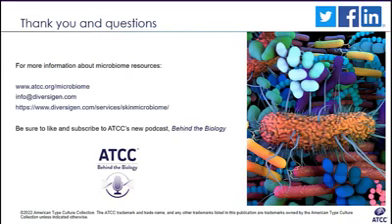I would say that the standards that we have right now do what they intend to do, just to make sure that your microbiome pipeline is reliable. And again, their applications may change depending on the goal of your study. We must make sure that all the steps of the microbiome pipeline, including skin microbiome, are standardized from the moment you collect your samples down to when you're analyzing the data. And that's probably one of the reasons why ATCC and other organizations are developing different standards for microbiome research, and probably the reason why we always include these mock communities in Diversigen. But I also suspect that we will continue to see a lot of these different standards evolving and changing with time.